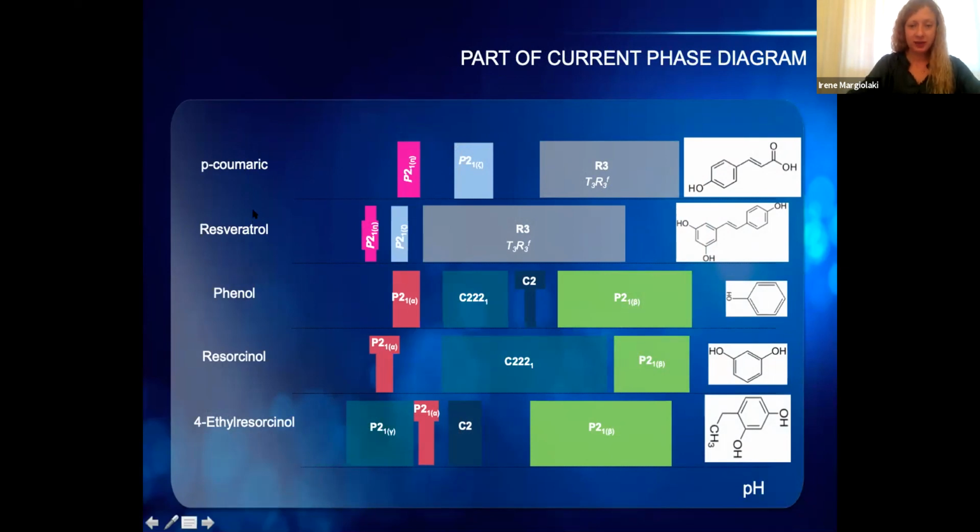On this axis are the ligands that you see their stereogeometry here. And on this axis, it's the increasing pH. Look at how polymorphic it is. The crystal form is changing even if we change the pH by 0.2 of a unit. So this was the first shock for a person not familiar with insulin.